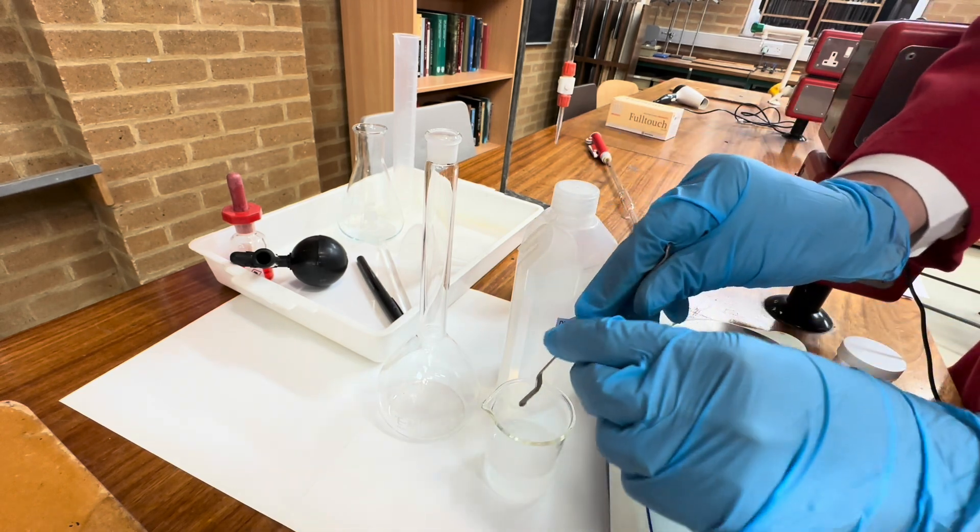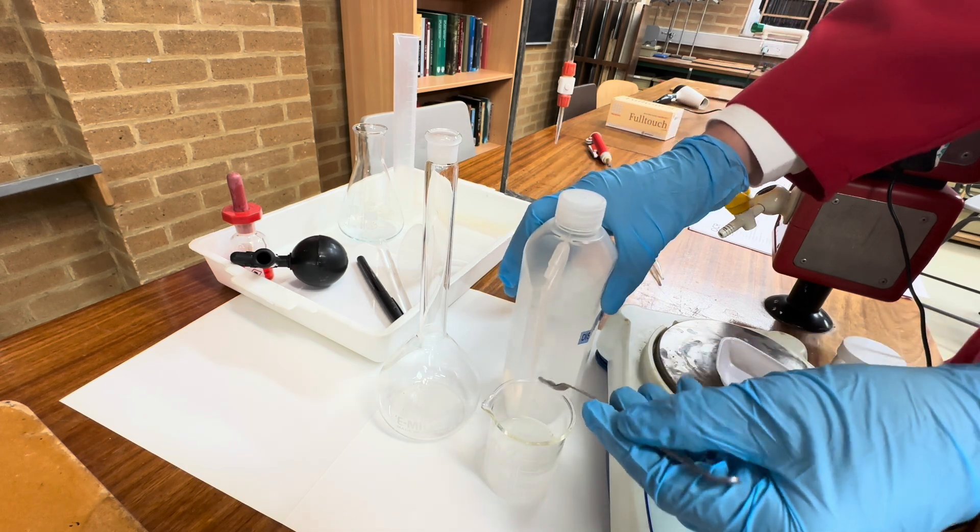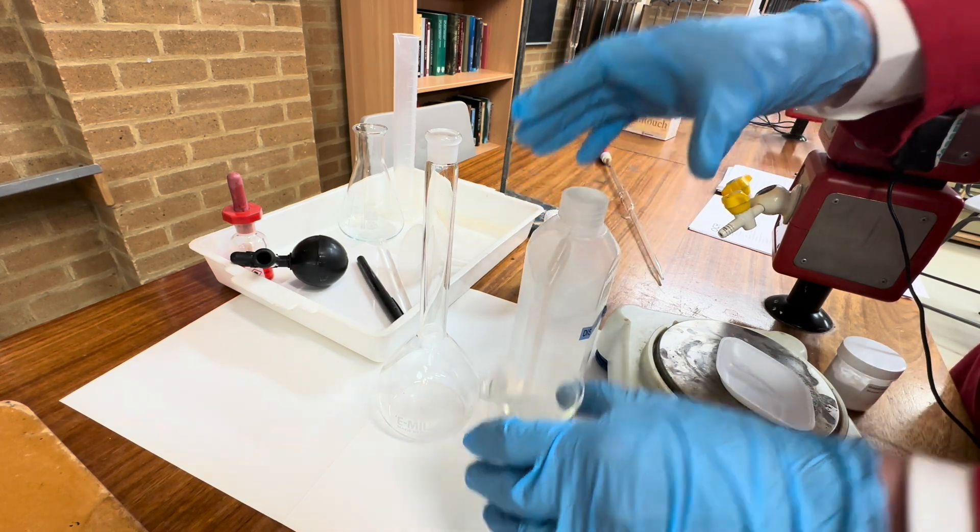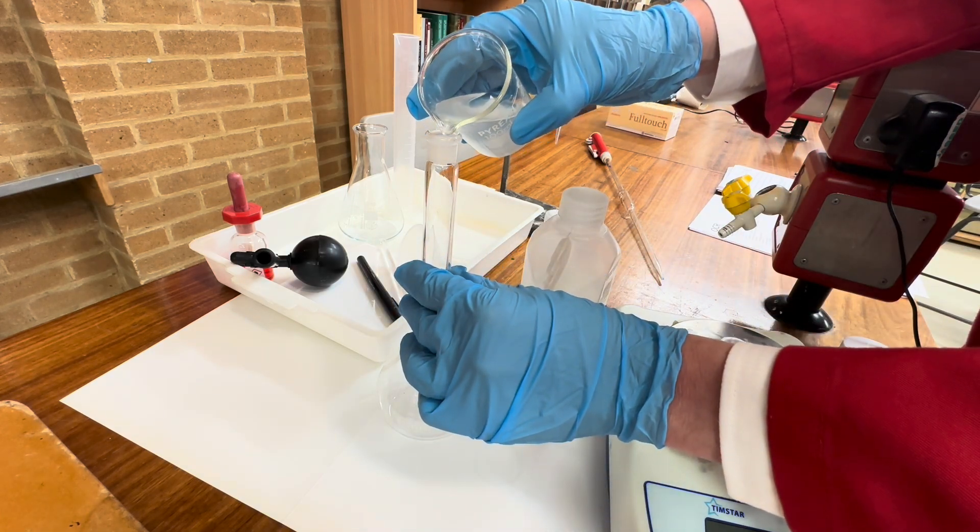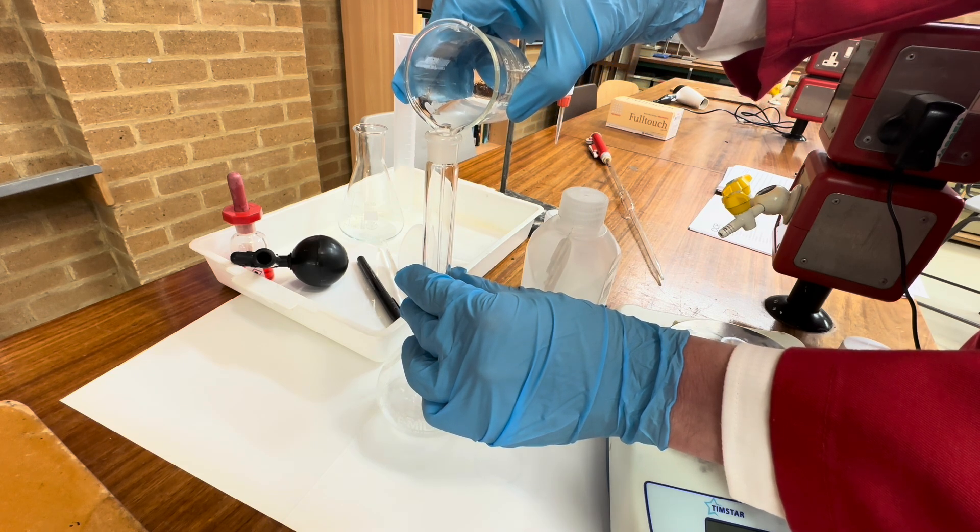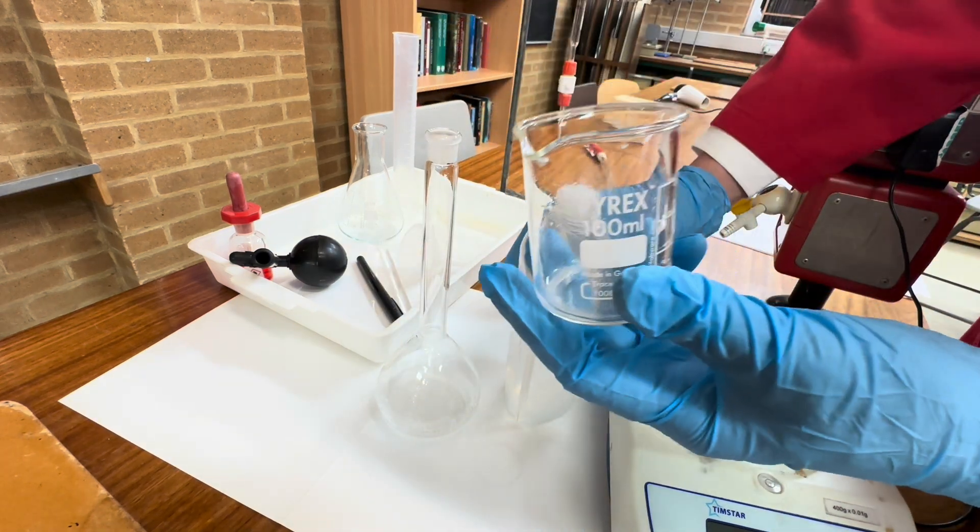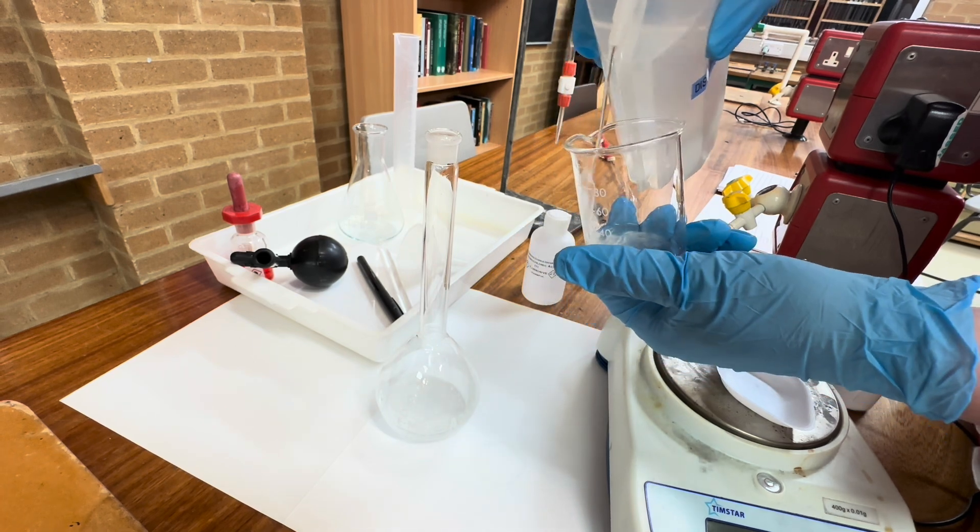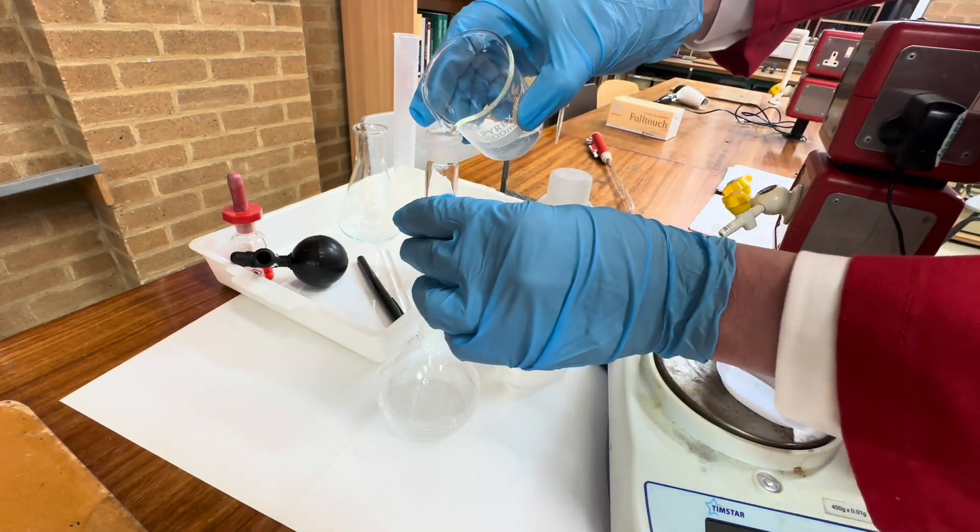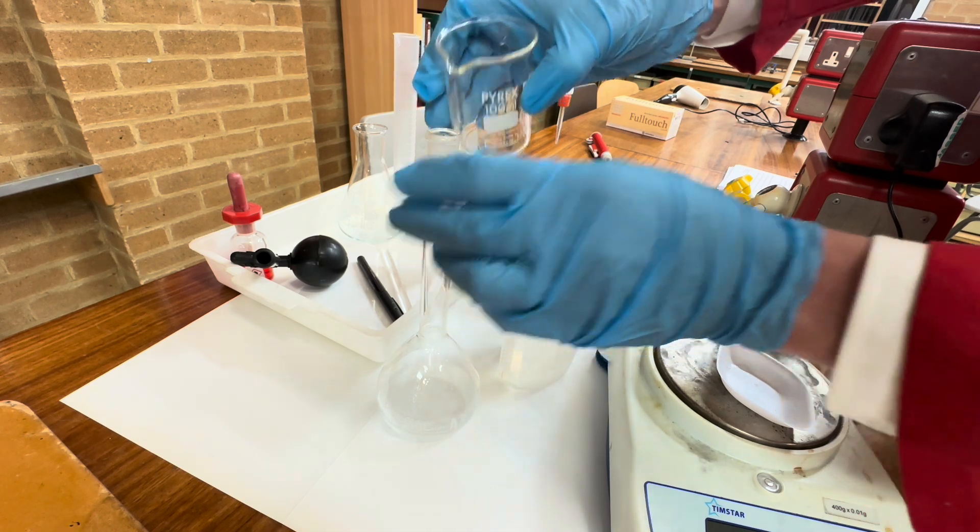Now an important detail here is we should rinse the spatula so that we've got all of the sodium hydrocarbonate in there, and then we will add this carefully to our volumetric flask. Because of the residue still in here, we're going to make sure that we've completely rinsed this beaker. Add this as well, and again.